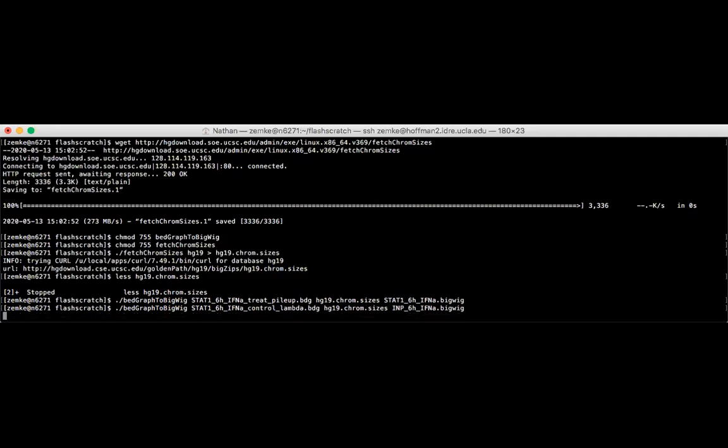bdg. And if you're confused about what we're doing exactly, it'll make more sense once we start using these files, and you can understand why we're generating them. Right now, we are setting up for downstream analysis that will actually give us data by doing the kind of boring stuff now to generate all the files that are going to be necessary to hopefully get interesting data.